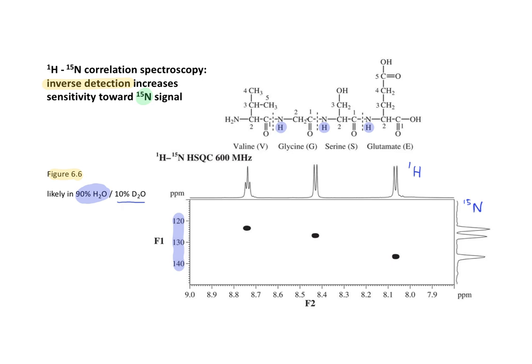For the corresponding proton signals, we see some difference in the chemical shifts between 8 and 9 parts per million, consistent with the ability of the amide NH to hydrogen bond, as well as the electron withdrawing effect from diamagnetic anisotropy of the attached carbonyl.